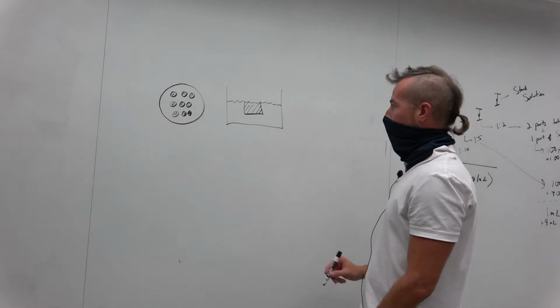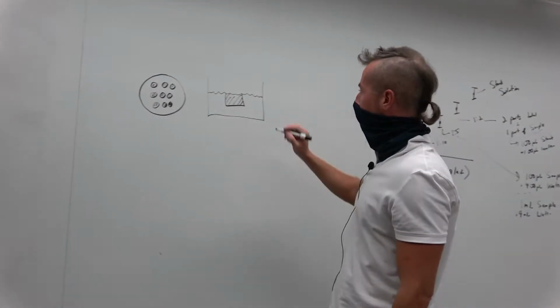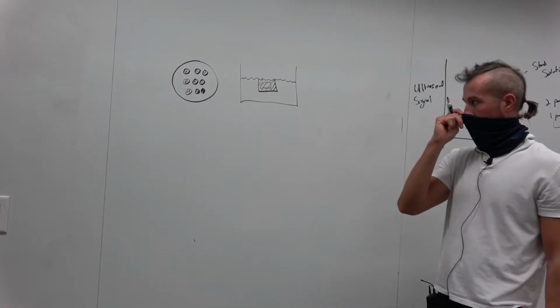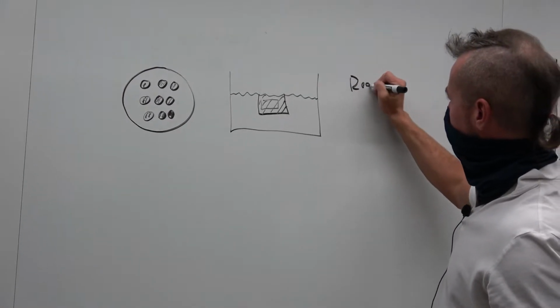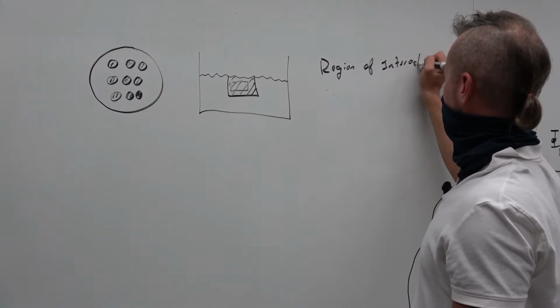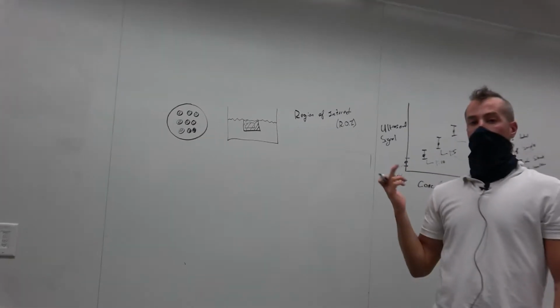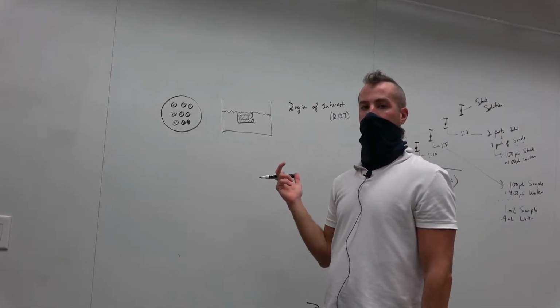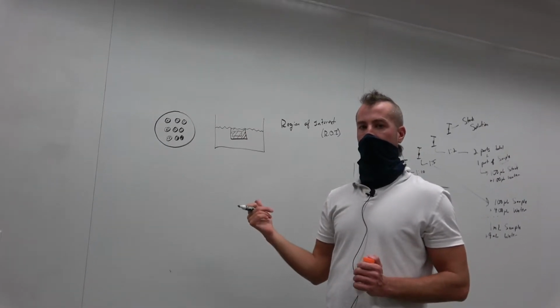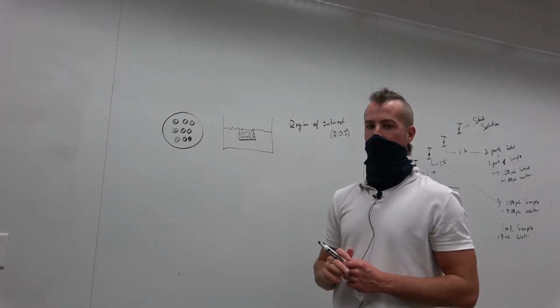And so what you're going to do with image analysis is to draw what's known as a region of interest, or an ROI. So this is going to be digital data, right? So each pixel here is going to have a value of what to what if it's an 8-bit image.